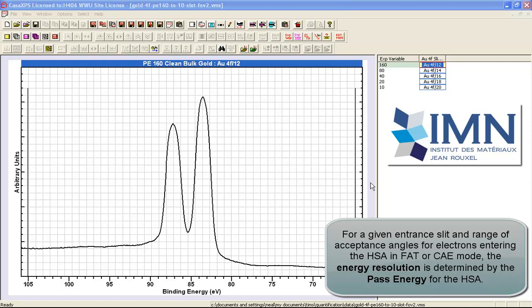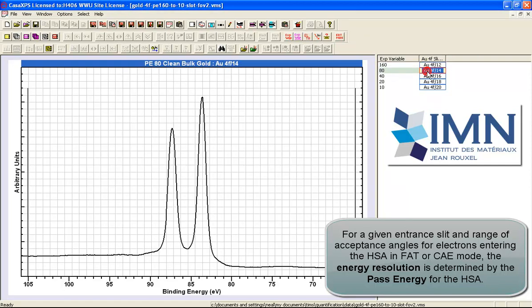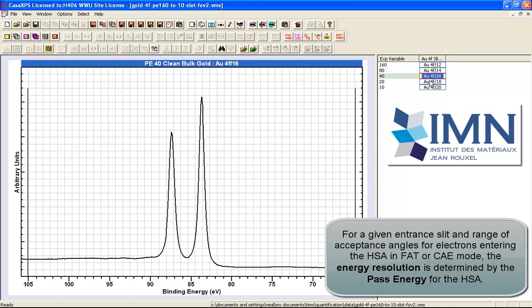When measuring XPS spectra, one of the choices that can be made in terms of the acquisition parameters is the pass energy. These data have been acquired from a gold sample and each one has been acquired using a different pass energy.